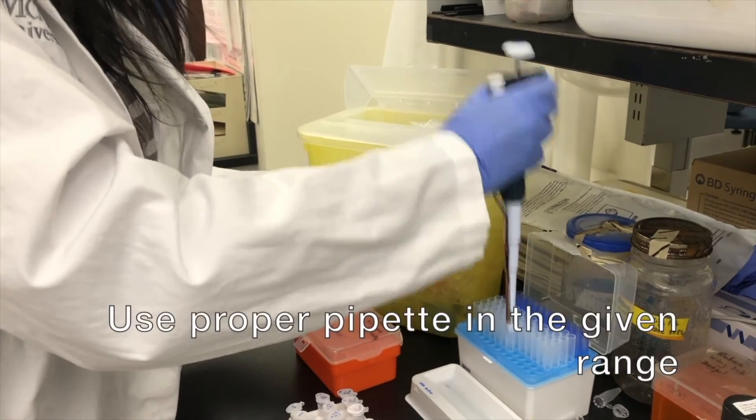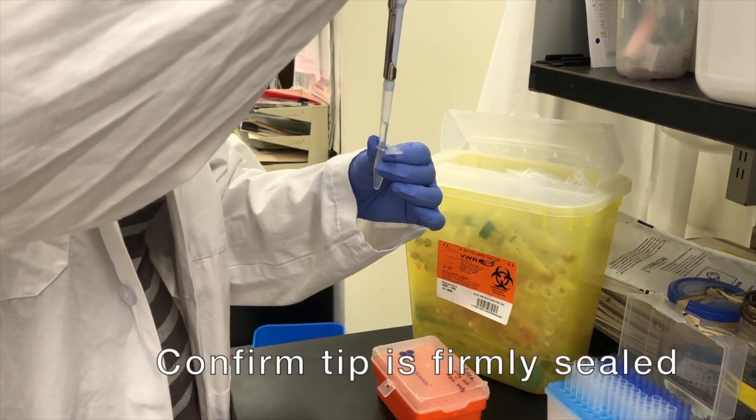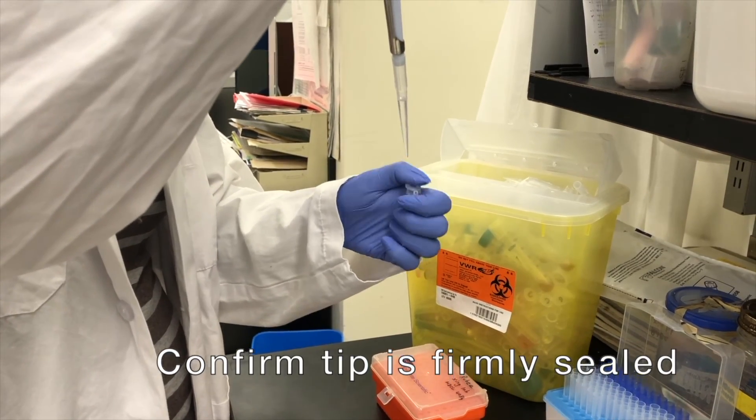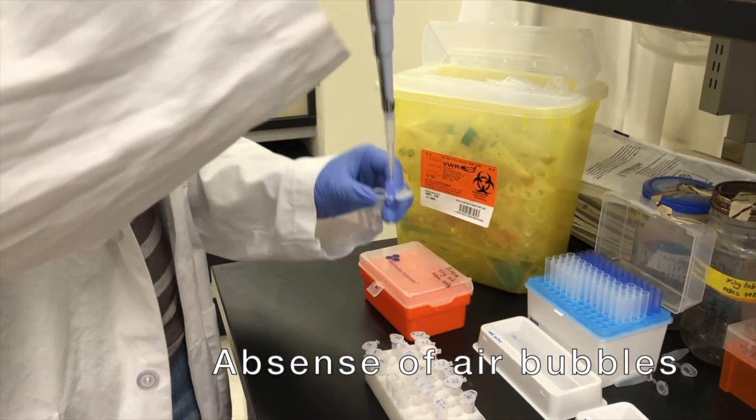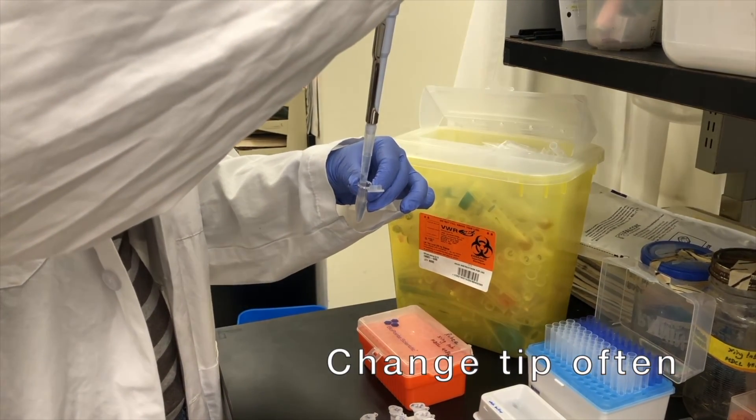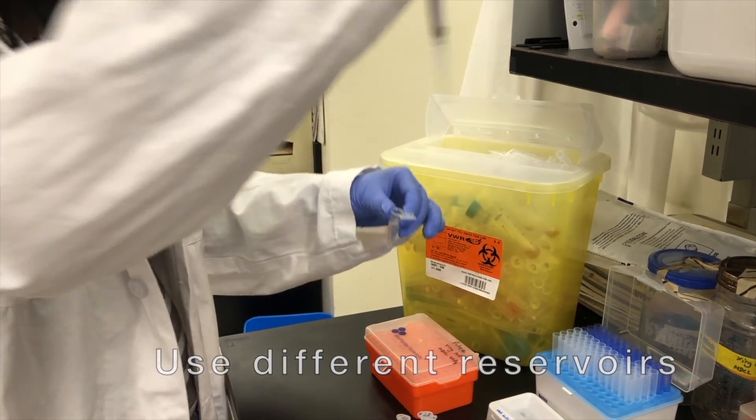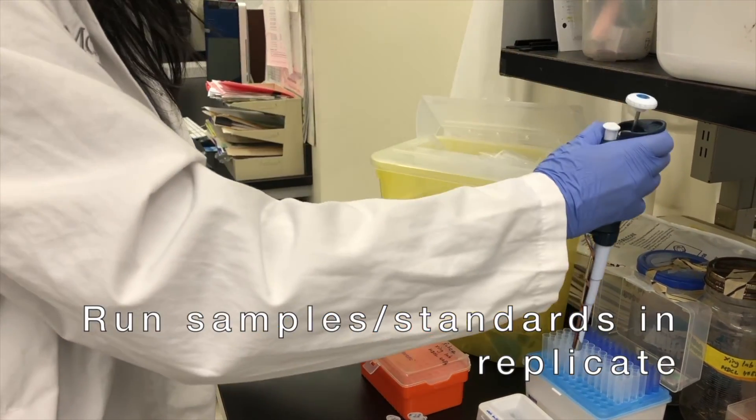Proper technique includes using the correct pipette that is within the range suggested by the manufacturer, confirming the tip is firmly sealed on the pipette, confirming the absence of air bubbles while pipetting, changing tips between each standard, sample, or reagent, using different reservoirs for each reagent, and always running samples and standards in replicate.